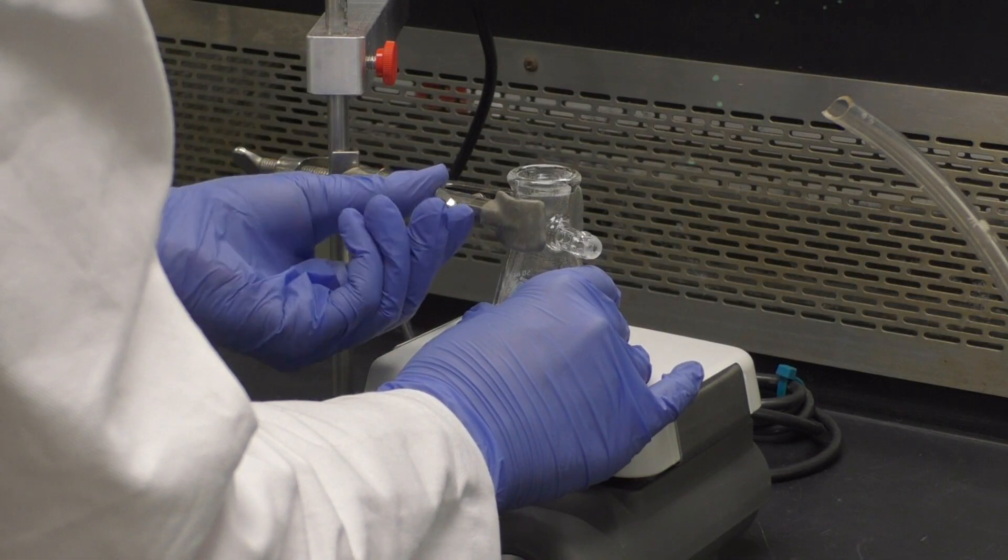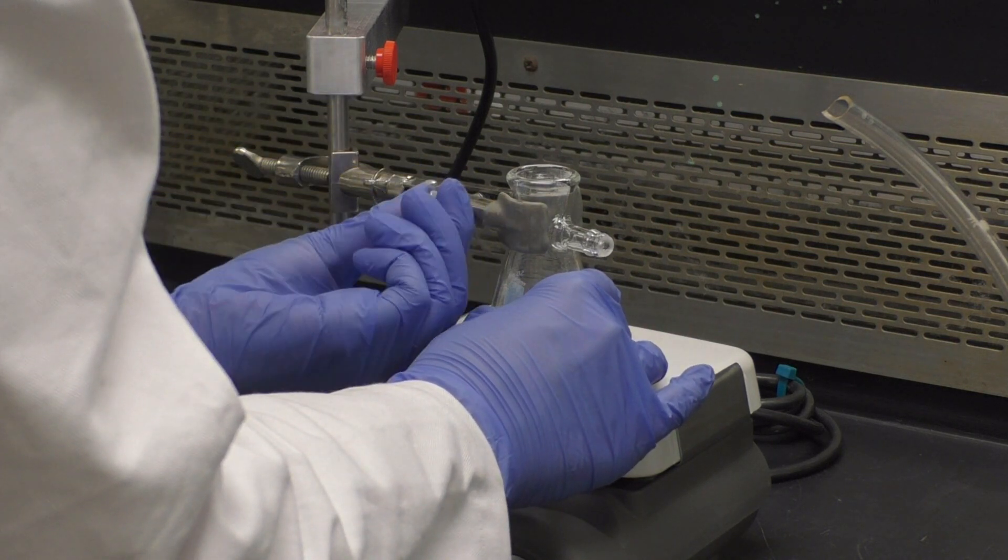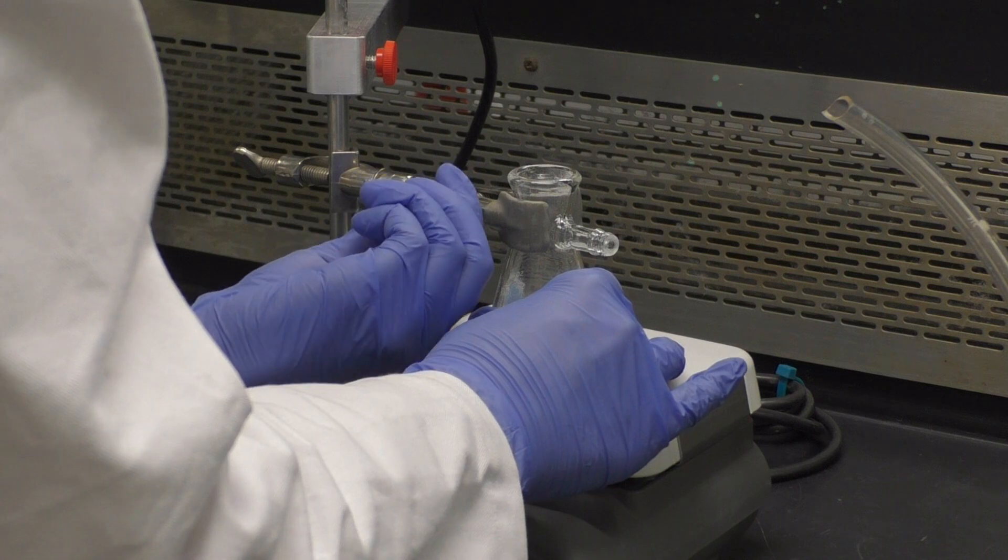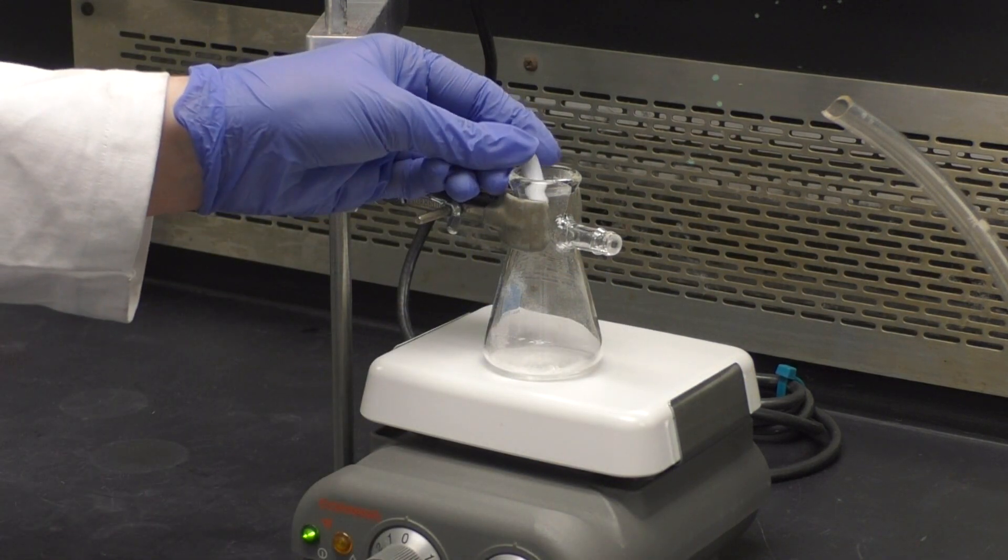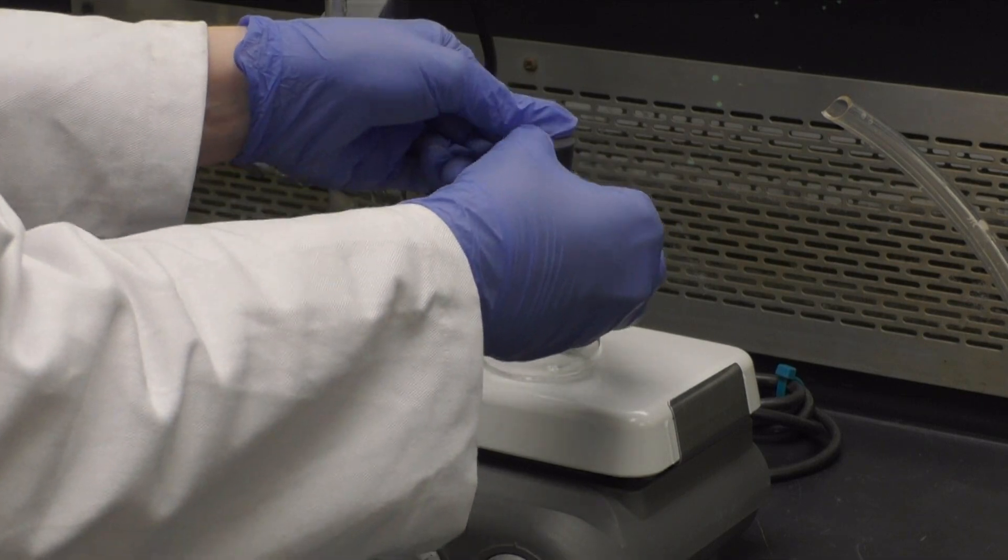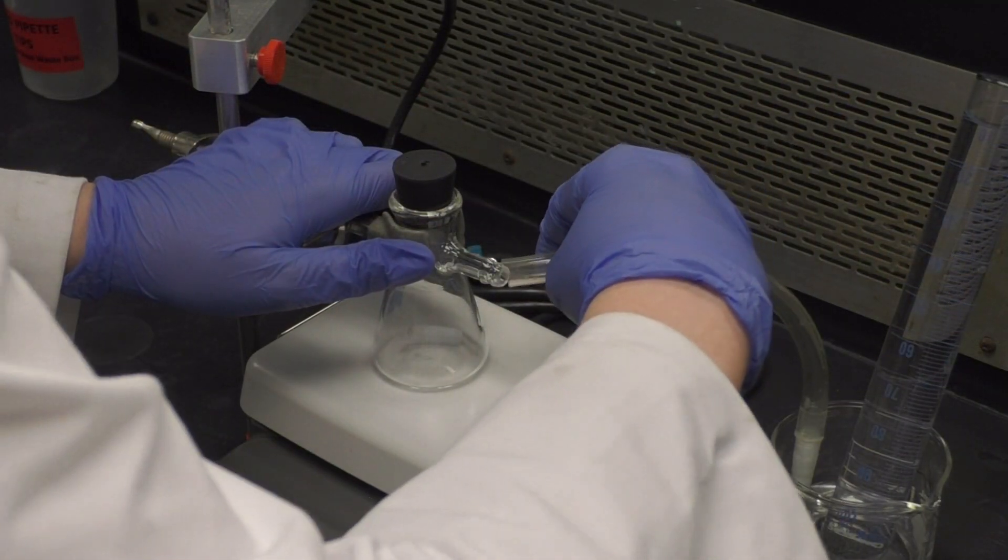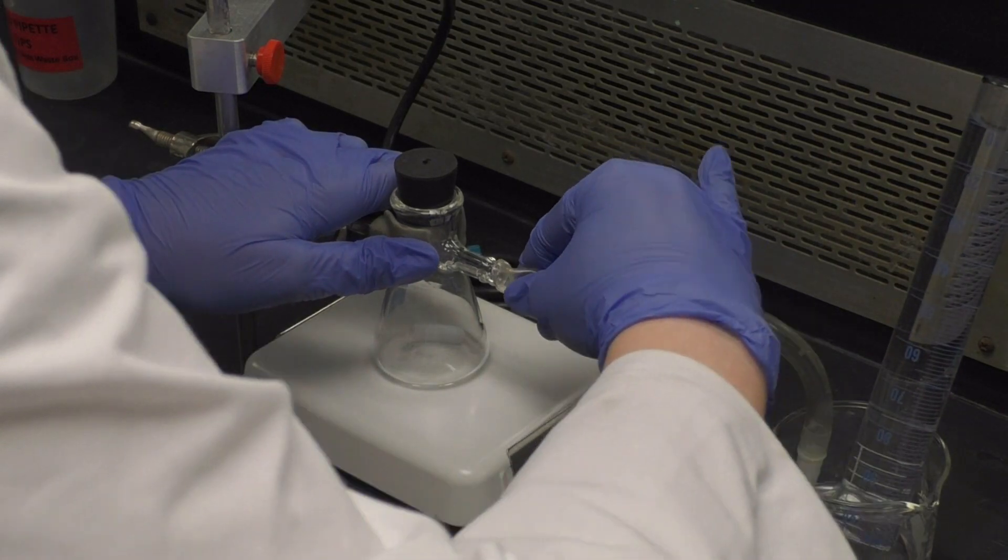Take your filter flask with the weighed sample, place it on a hot plate stirrer, and secure it to a support stand with a two prong clamp. Next, add your 1 inch stir bar and place the rubber stopper securely on top. Finally, attach the plastic tubing to the neck of the filter flask to finish your gas collection setup.